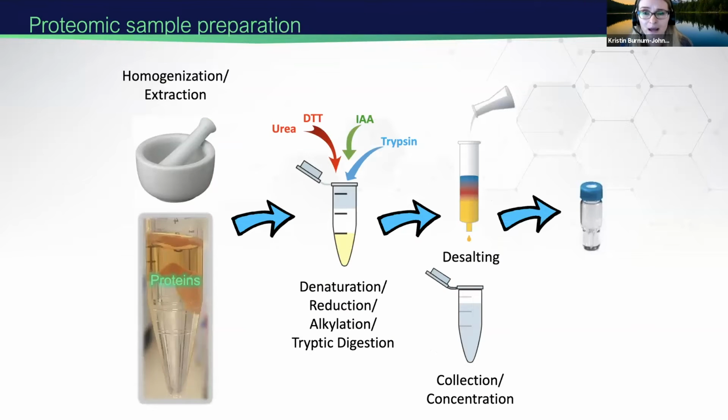Now, in traditional bottom-up proteomic sample preparation, for our Aspergillus pseudoterreus samples, we homogenize frozen fungus pieces prior to MPLEX to ensure efficient cell lysis. Those of you that have worked with fungus before know it has that rigid structure outside, so the homogenization helps with that. So we take our tissue, we homogenize, and we extract the proteins. Then we denature, reduce, and alkylate. Reduction and alkylation of the disulfide bridges keeps the protein denatured.